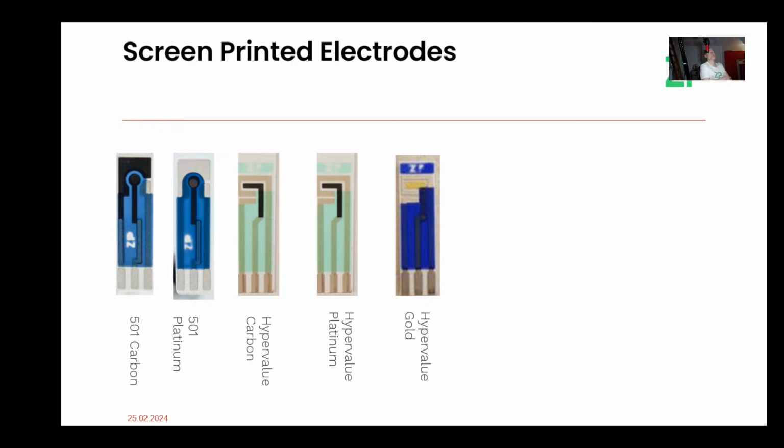All electroanalytical work should leave the lab and go into the real world to help real people with real problems. Carbon is the most translatable material when it comes to commercialization. It's just by far the lowest cost. I have done some calculations, and it's something like 1/28,000th of the price of gold. So if you're trying to make a product, or you're trying to do science that you want to translate into real products, please, when given the choice, choose carbon.